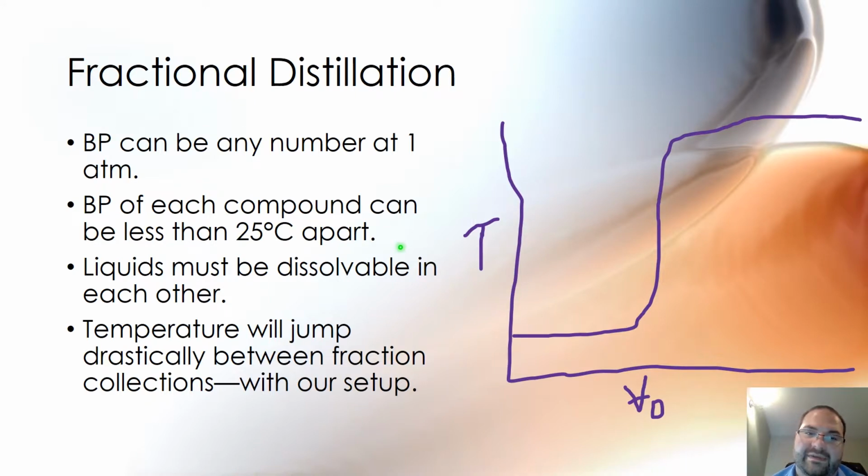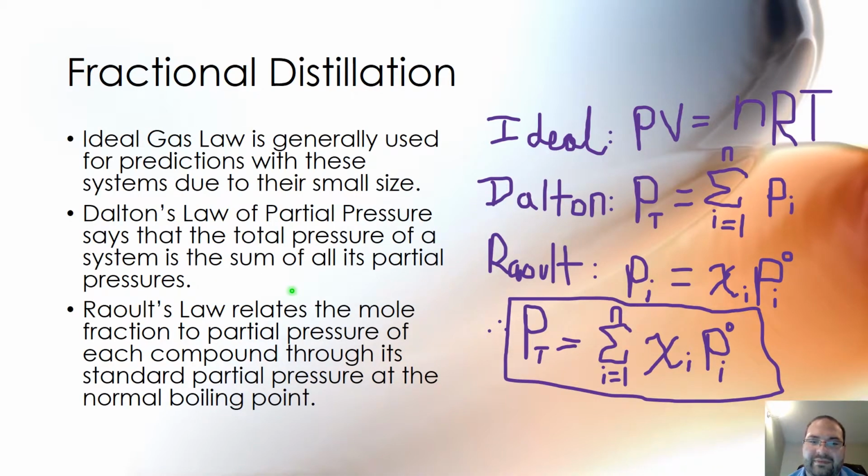That's what makes it different from everything else we'll talk about. We'll spend the majority of the time in this lecture talking about fractional distillation and why it works, because it's the most important one. Alright.